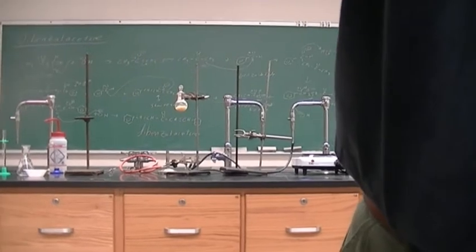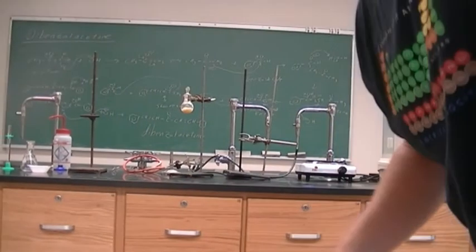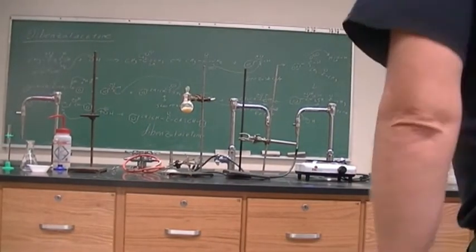Alright, so we are ready to do the reaction. That is a classic mechanism. Remember, you have to do it in steps, balance every step, get the overall reaction.